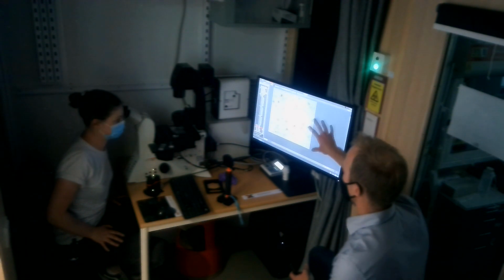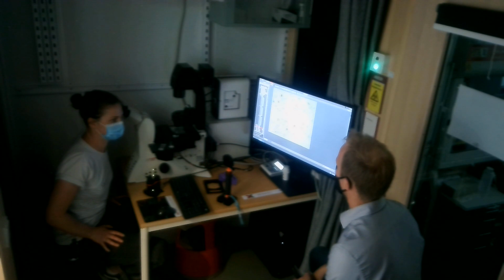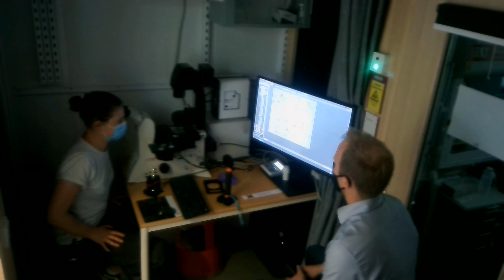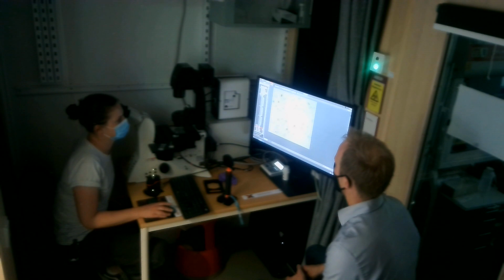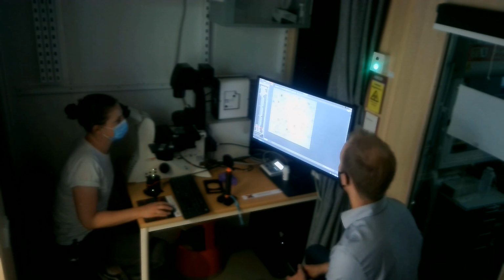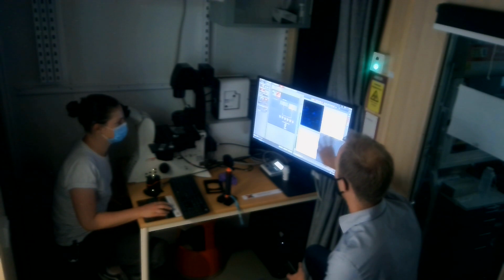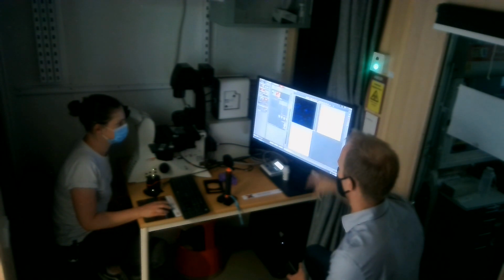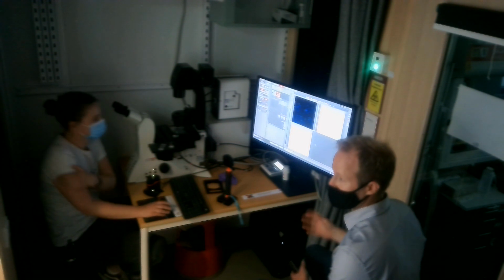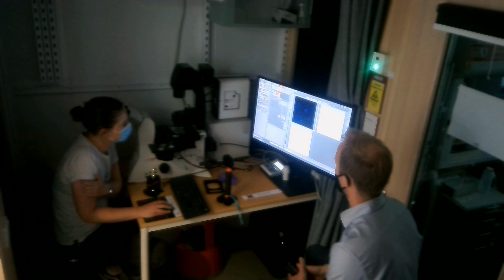So a lot of these viewing options and so on is stuff that is still being developed in Navigator, I think. So some of these buttons are new to me. And this is also why very often I'm still working in the default interface. So I get that by closing? Yeah, you can close that one. So here you have it. Here I find it easier to move around and work with these, and also to actually open up more images and compare images between each other. You can do that also very easily.